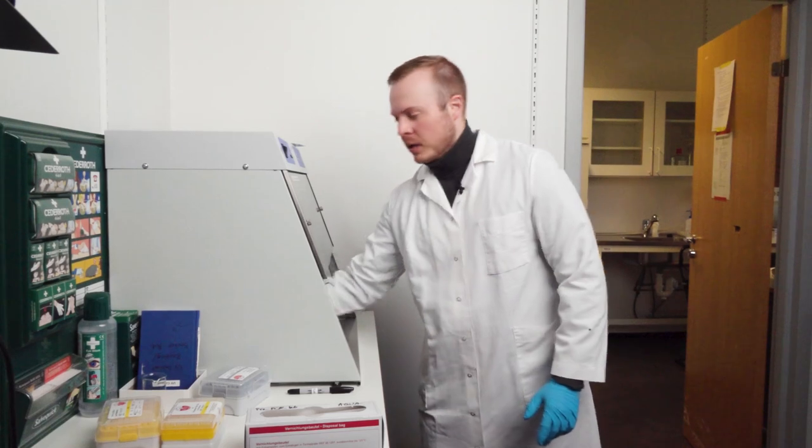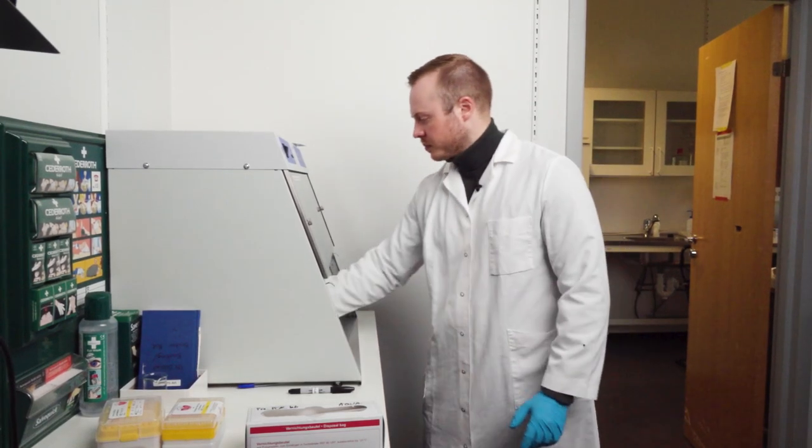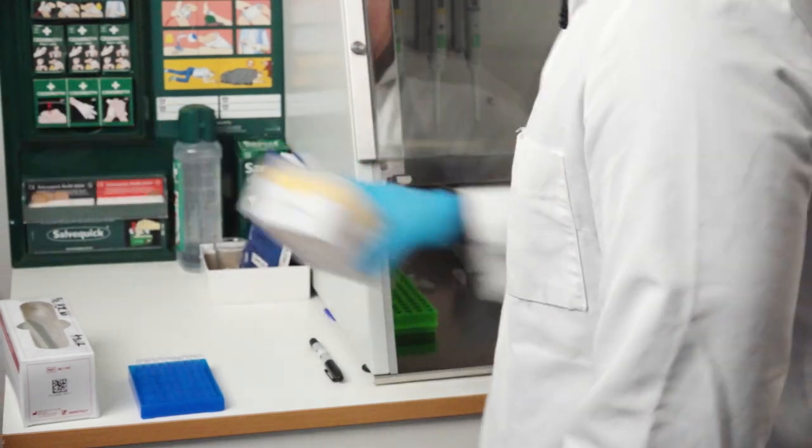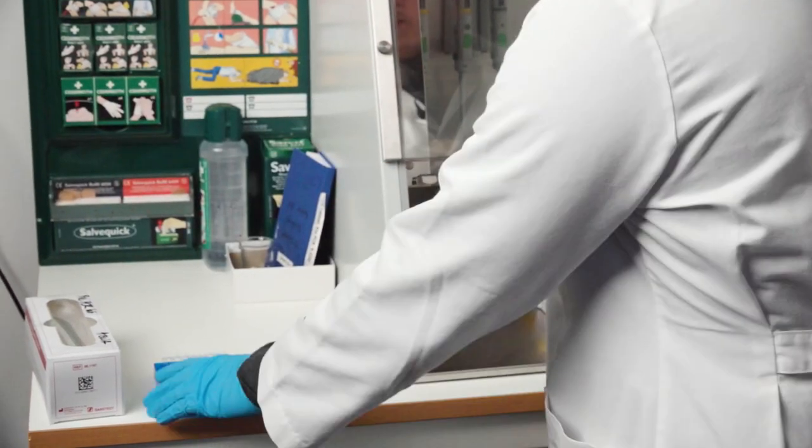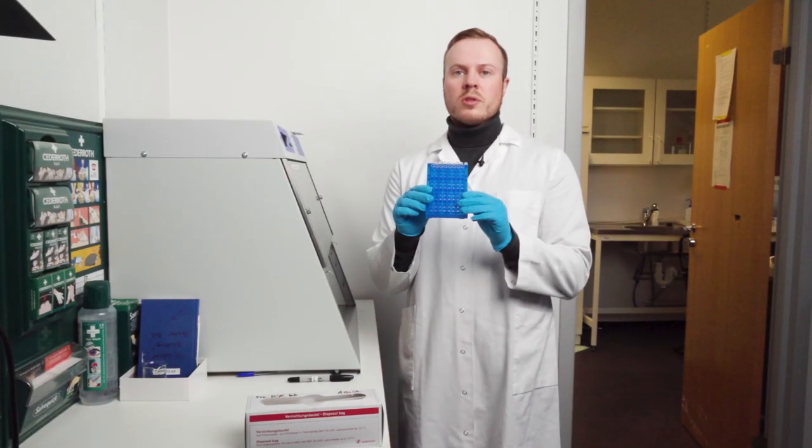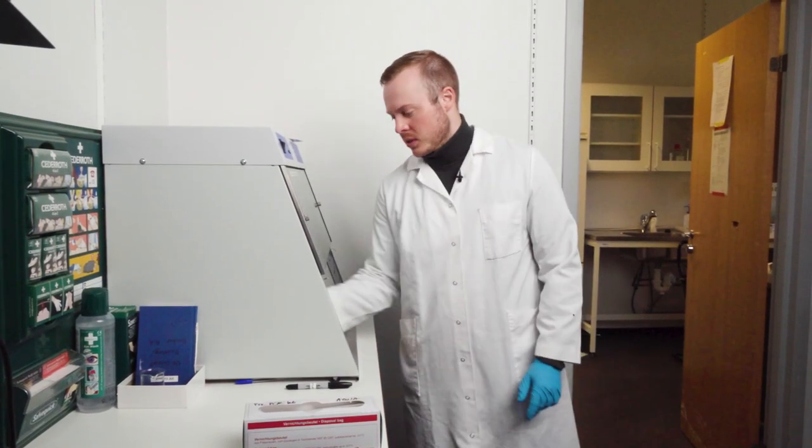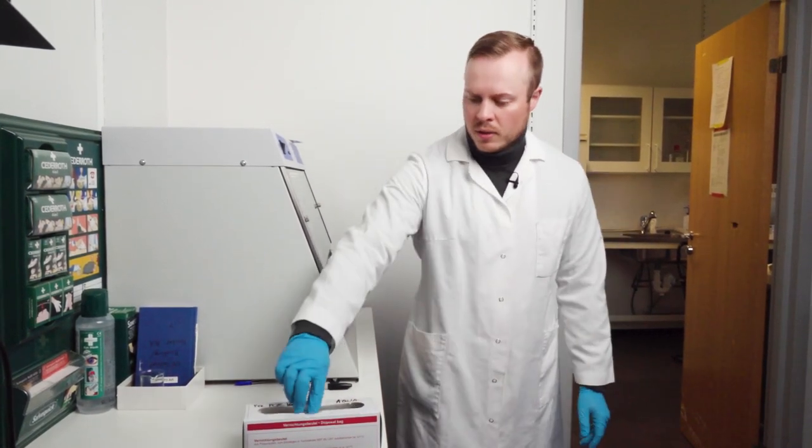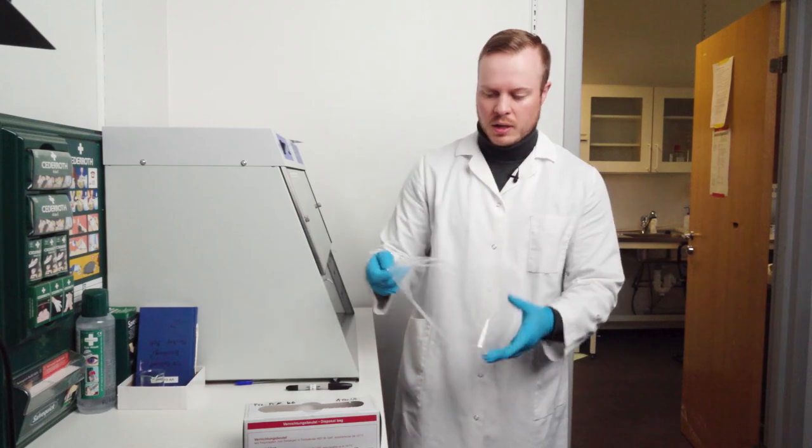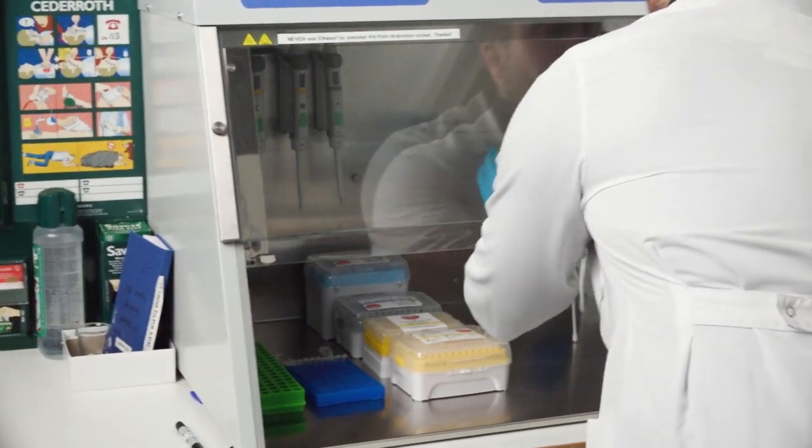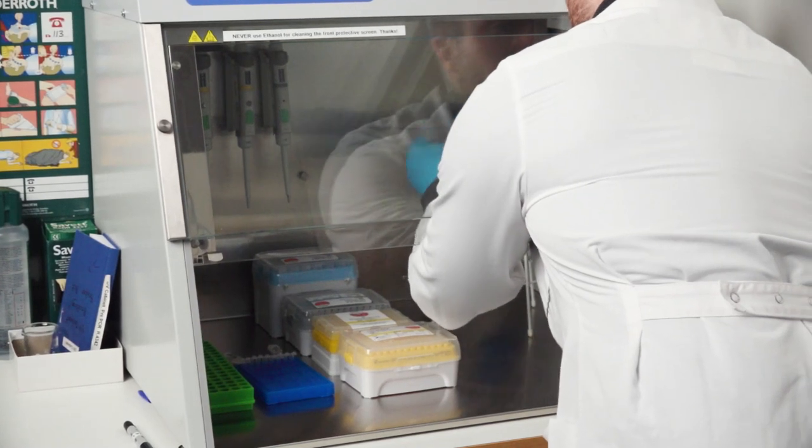Then we move in the pipette tips that we will use. Then we have the PCR tubes that we will do the reactions in. Those also need to be sterilized with UV light. And we take a plastic trash bag and prepare that as well in the UV cabinet.